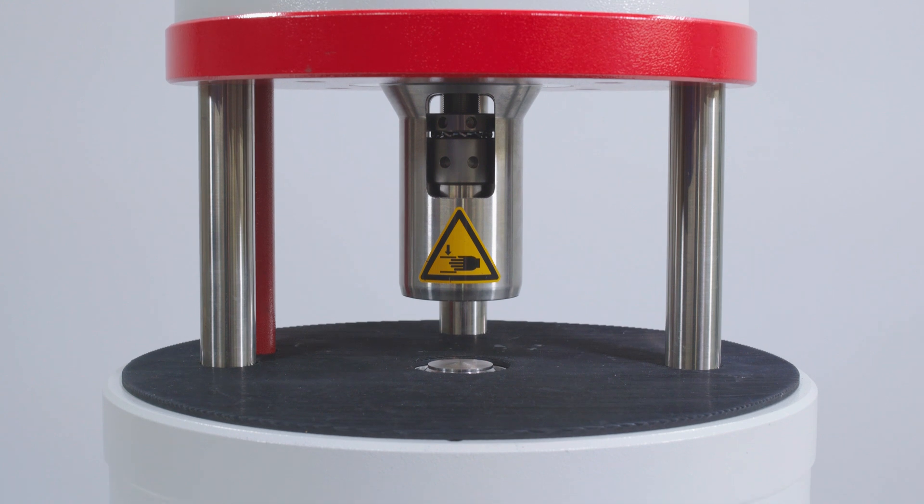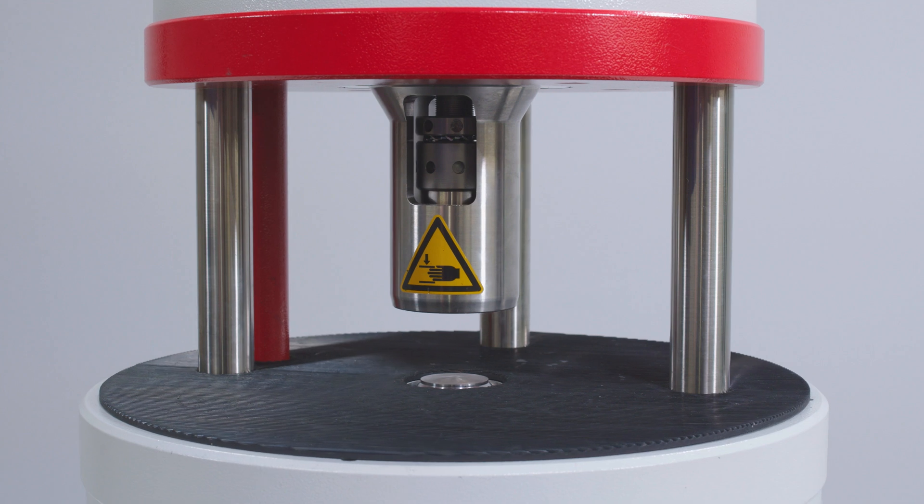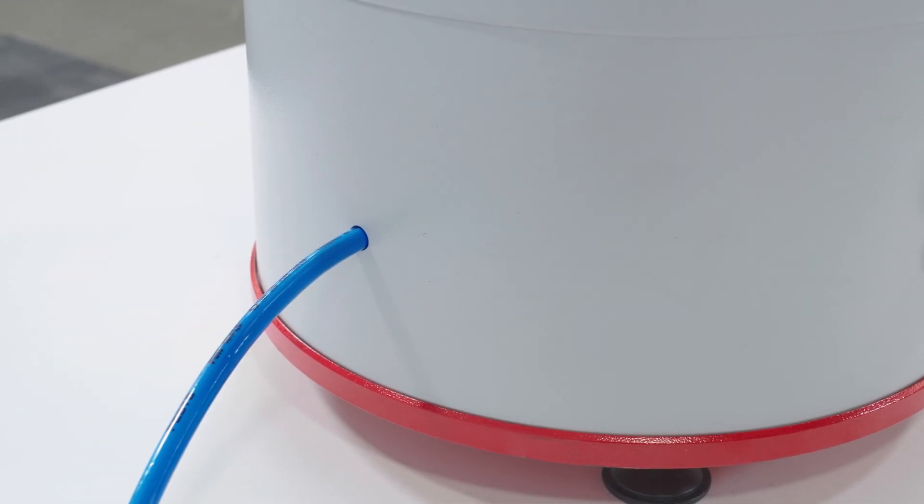The RVS is built to last and requires minimal maintenance. Constructed from high strength aluminum and stainless steel, it is tough enough to be used directly on the production floor and only requires compressed air for operation.